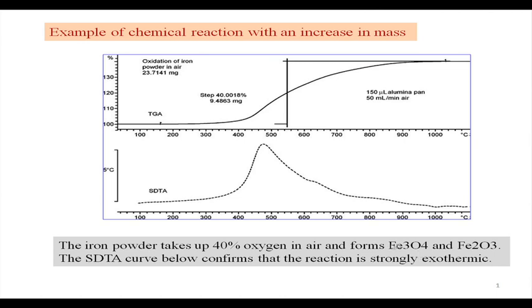So, ferrosoferric oxide means you can have a certain percentage in the ratio of 2:1. Two of the iron centers are present in the trivalent state, that means in the ferric state, and one will be in the ferrous state. So, this is in the lower range, that means this will form first, and when you have the complete oxidation, the Fe3O4 will be converted to Fe2O3.